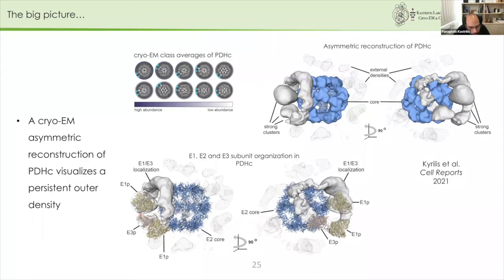Susanna, we can also discuss the binders and the non-binders in the case of these huge complexes. Basically, the discussion that we had before we go is about this slide here, do you see my screen? No. Okay. So in this slide, you have this external subunit. The E1 and the E3 are in proximity, but should never form an interaction interface.